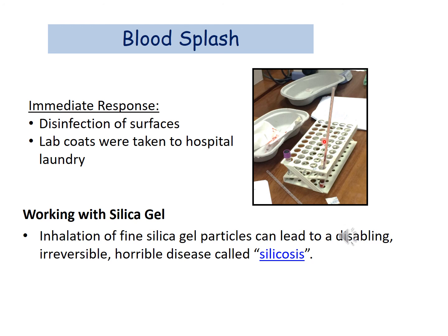If blood splashes happen onto your lab coats or other PPE, you should remove them. And of course, if any blood drops contact your body parts, just wash quickly, okay?